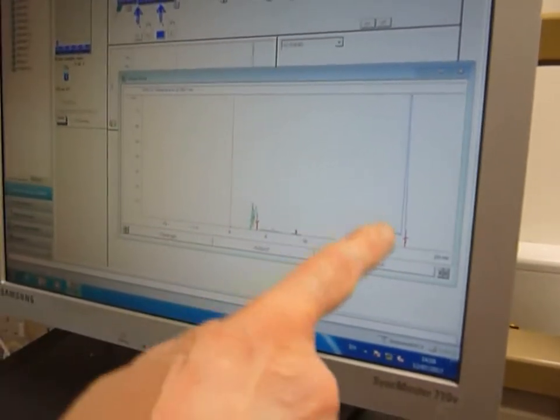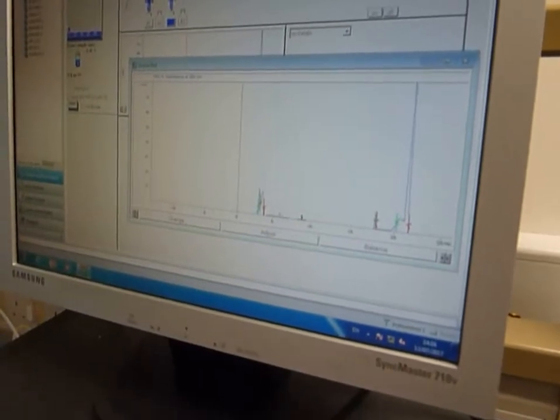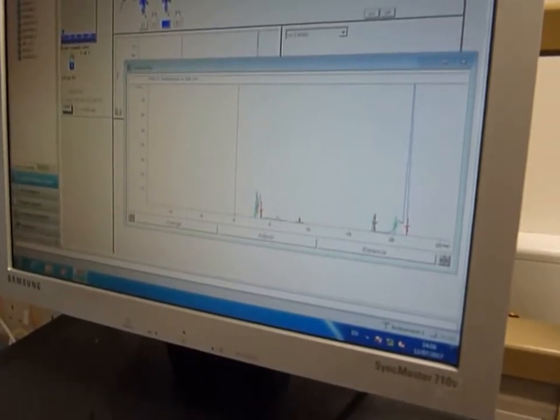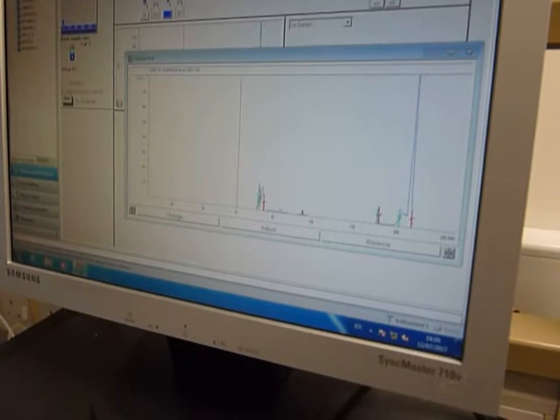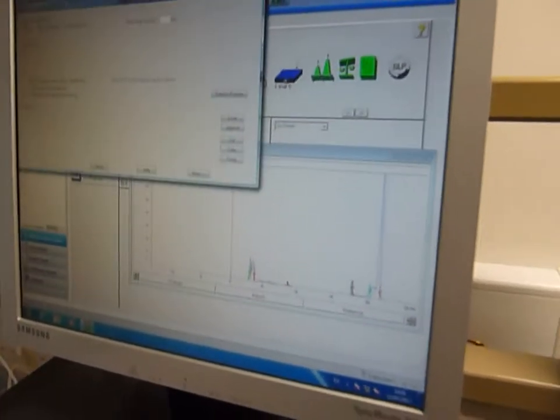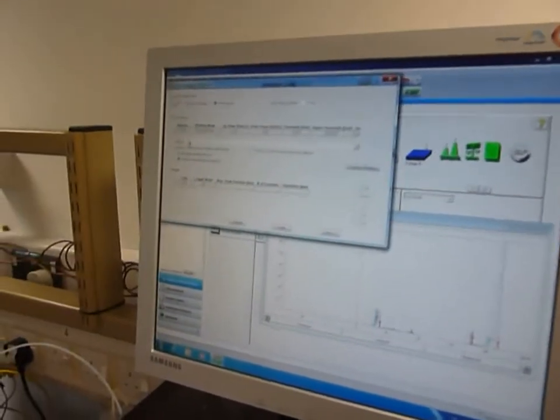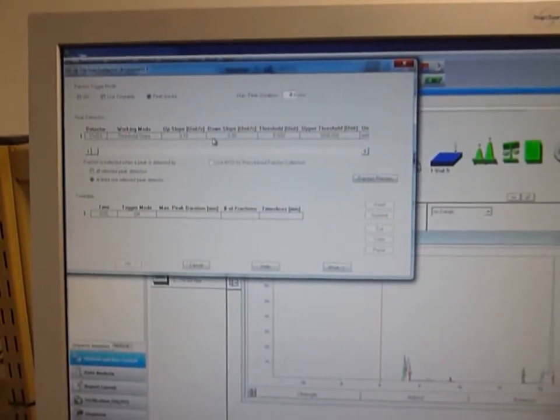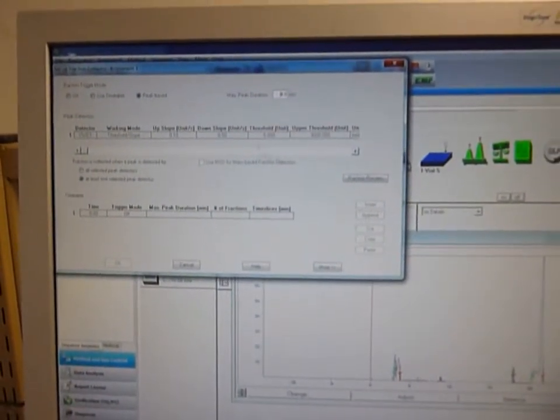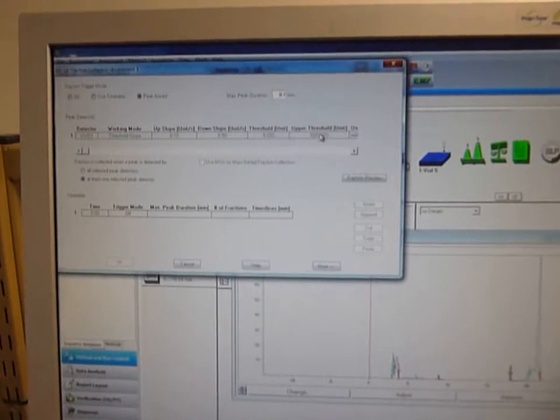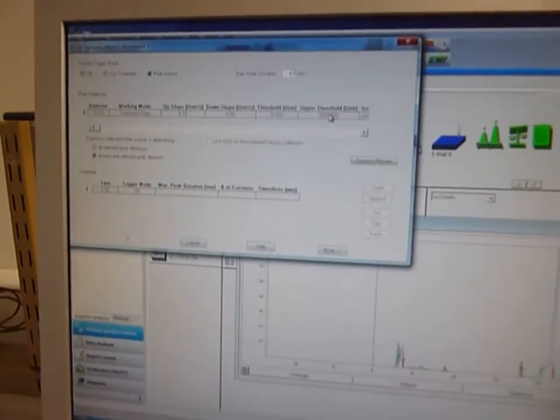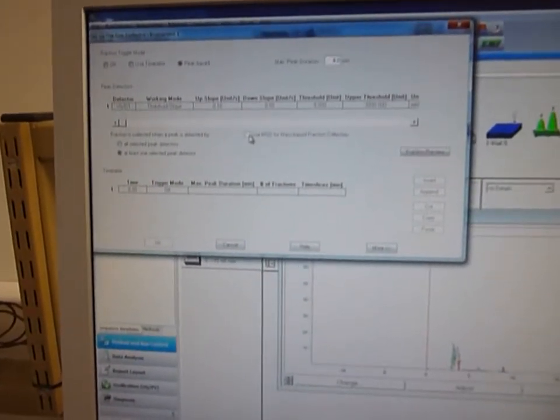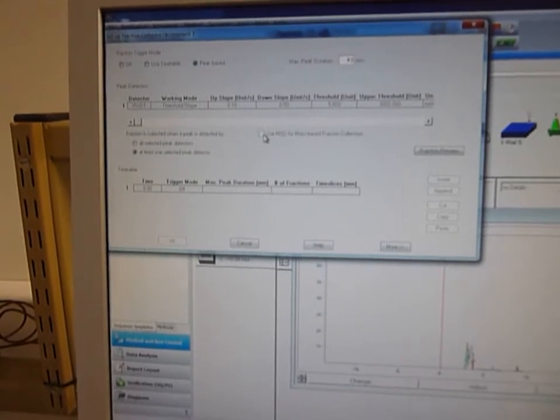And you'll see here, this is how you set up the fraction collector. I've got it based on a variable wavelength detector, the upslope and the downslope, that's what determines the threshold when it starts collecting and the maximum level that it will collect up to. You can also link it up to a LC-MSD detector as well.